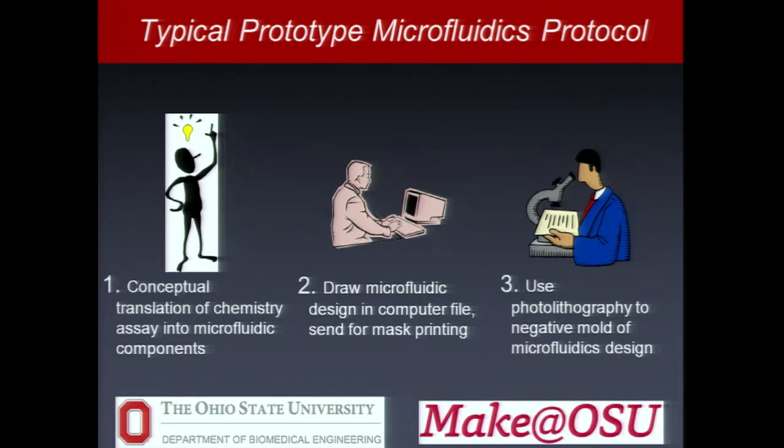All right, so how do we make these? If you're interested in working on these, this is my greatly oversimplified concept, but we conceptualize what we want to make. We draw up some sort of microfluidic plan. This is actually where the design comes in of how do we convert the idea we want it to flow at this flow rate over these cells in a laminar flow versus non-laminar flow and so on.